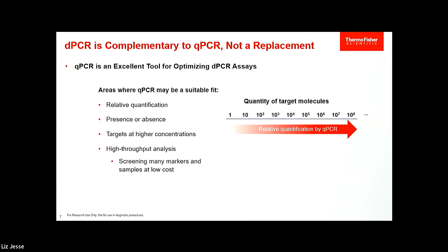If you envision qPCR, so first of all, I am not trying to get you off of qPCR. qPCR and digital PCR are very complementary to each other. The question is when do you decide to use one versus using the other? You'll notice from the chart up there that qPCR, real-time PCR, provides a wide range of detection, over 8 orders of magnitude.